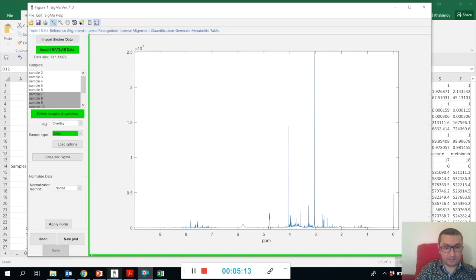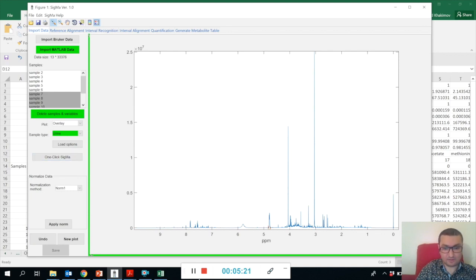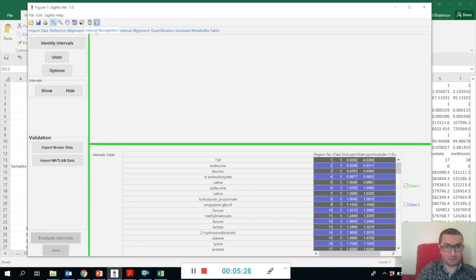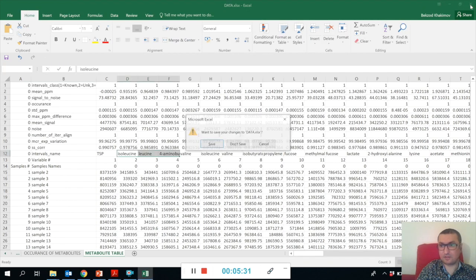Let me just go back to our Sigma. Now we have done just One-Click Sigma, but I would like to show you all the tabs separately. That's why I'm just going to close this session of Sigma.